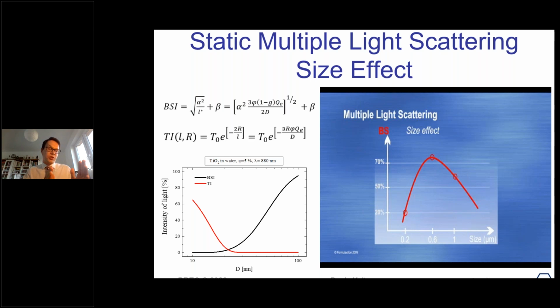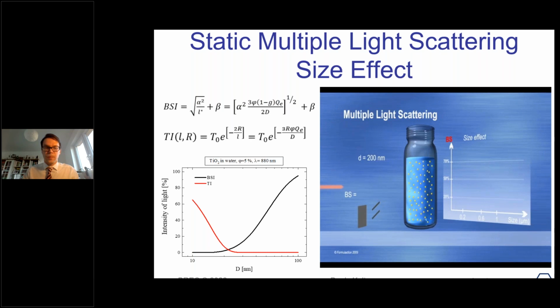The only restriction here, we were developing this document in the nanotechnology committee, so it was restricted to this uprising of the curve, the black curve here in the bottom left corner, where the curve is monotonically increasing upwards, so it doesn't curl backwards. That was the one very important aspect.